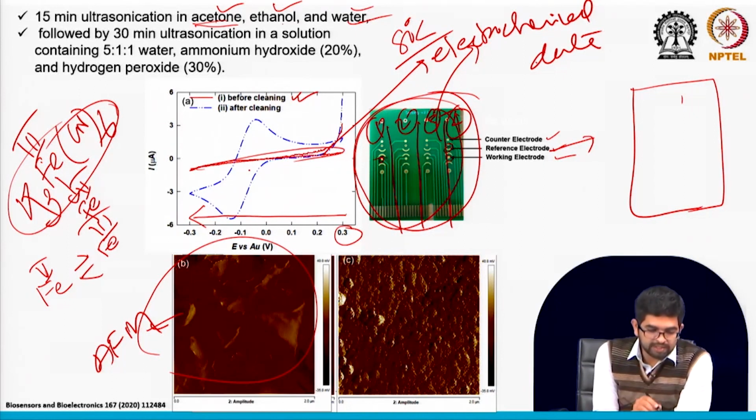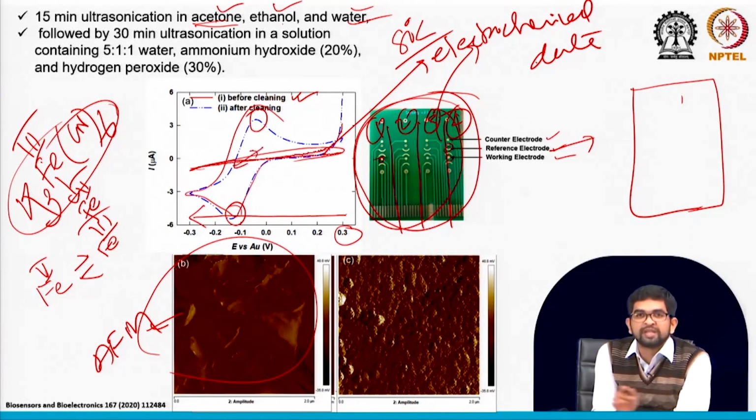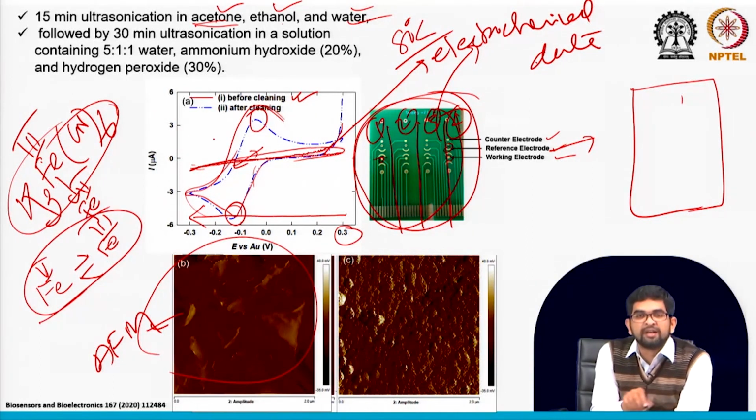See, immediately when you clean the surface, you can observe the reduction and oxidation, a very good reversible peak. But at the very beginning there is almost no peak, only a very small current you are getting. Immediately after cleaning you are getting a very good shape, like Fe2 to Fe3 conversion is happening now properly, this reversible reaction is happening now on the surface properly.